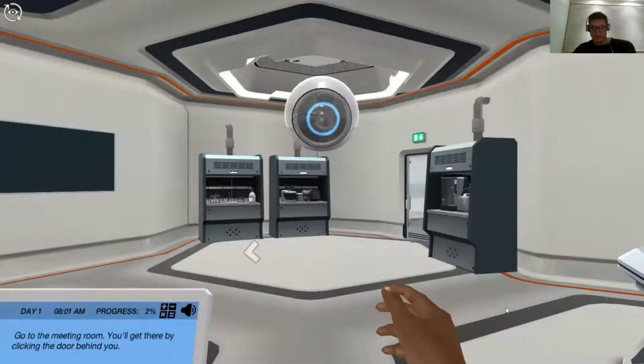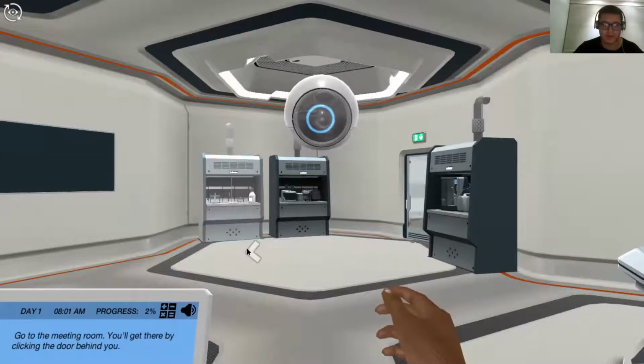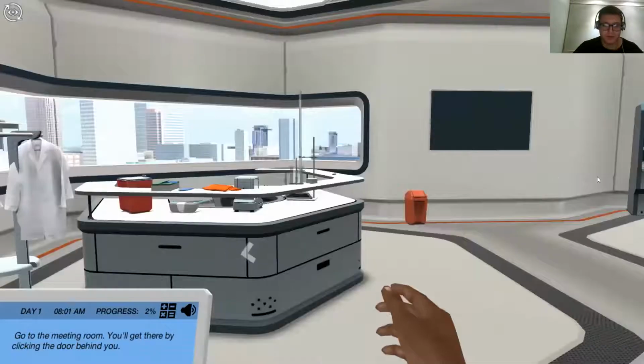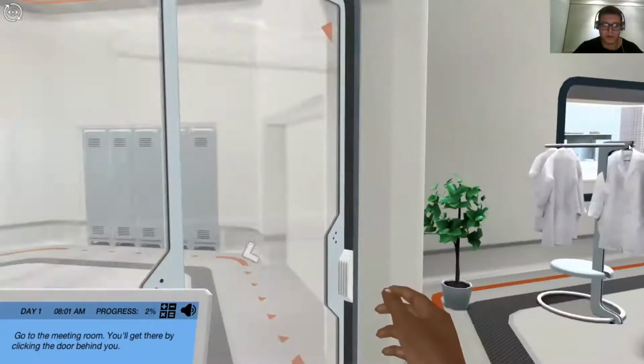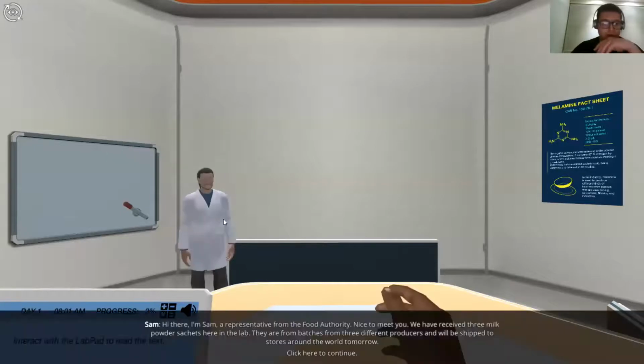Go to the meeting room. You'll get there by clicking the door behind you. Talk to the Food Authority representative. Hi there, I'm Sam, a representative from the Food Authority. Nice to meet you. We have received 3 milk powder sachets here in the lab. They are from batches from 3 different producers and will be shipped to stores around the world tomorrow.